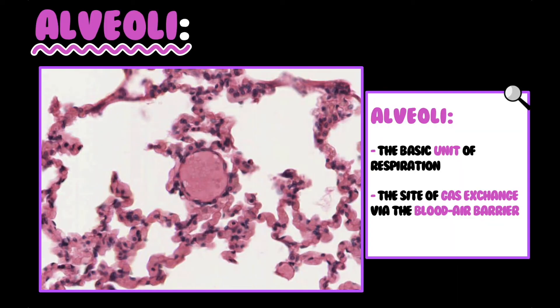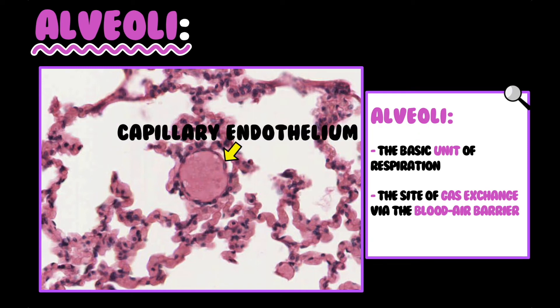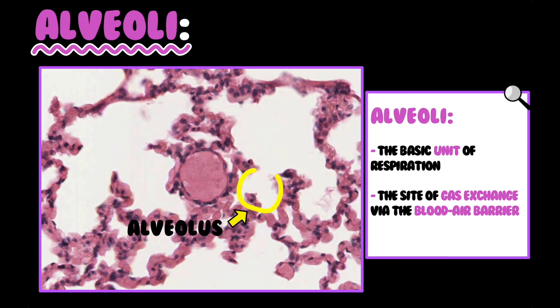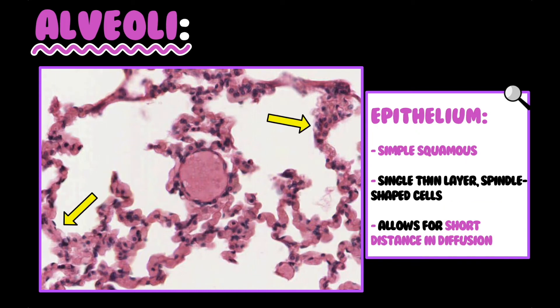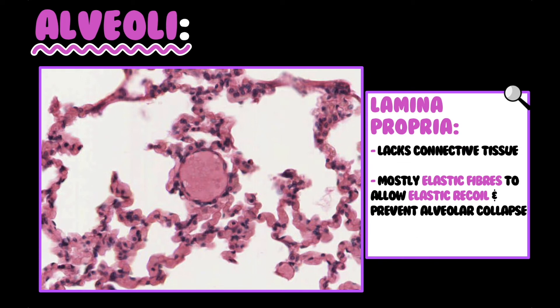The alveolus is the basic unit of respiration and the site of gas exchange via the blood-air barrier. There is a capillary with capillary endothelium, an air space, and multiple alveoli which together constitute an acinus. The epithelium is simple squamous — a single thin layer of spindle-shaped cells — allowing for a short diffusion distance. The lamina propria is generally lacking in connective tissue but is rich in elastic fibres to allow elastic recoil and prevent alveolar collapse.